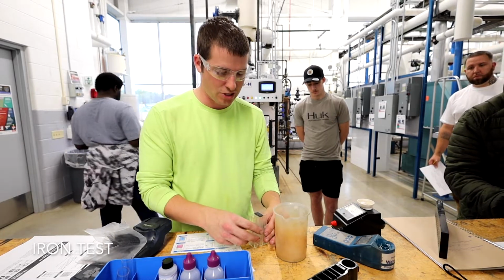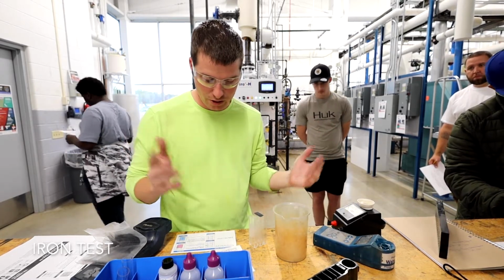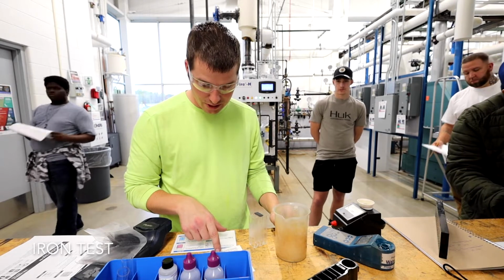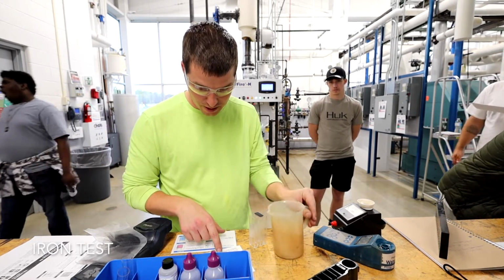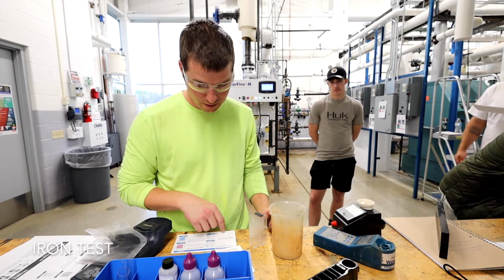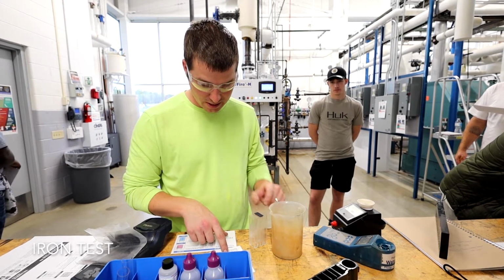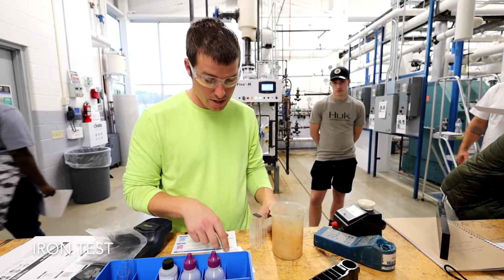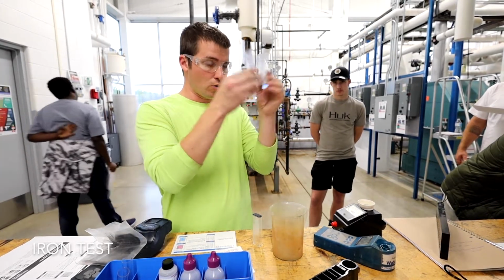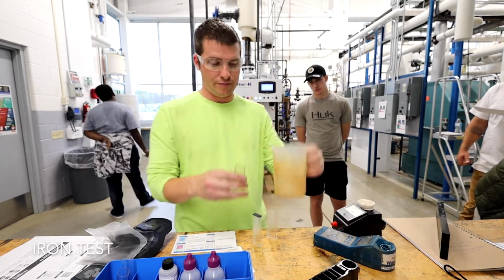A lot of these tests are just setting it up properly, and you should have no issues. Use 3 test cells for each test. 2 should be filled to the mark with untreated sample, what's in my cup, and placed on both sides of the center compartment of the comparator base. The 3rd test cell is used for treating the sample with reagents and is placed in the center. So the 2 outer ones, we're just going to fill up with water and do nothing with them.